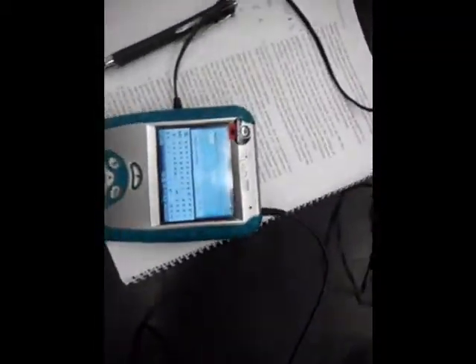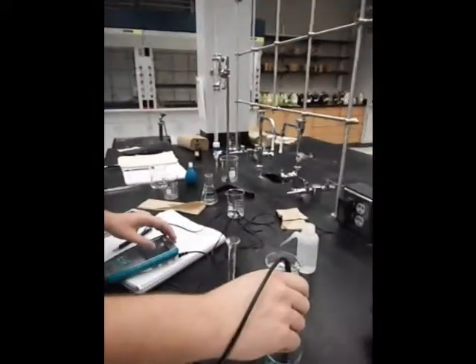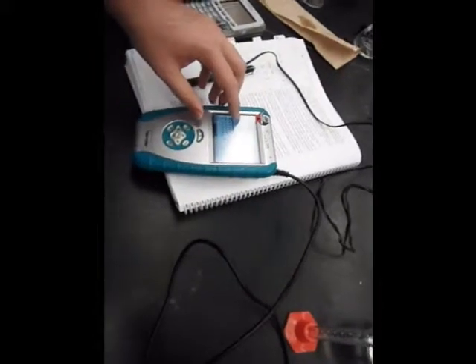Once you've taken the pH of the 7, you're going to move on to the 4. If you were doing a base, you'd move on to 10 rather than 4, but you always start with the 7.